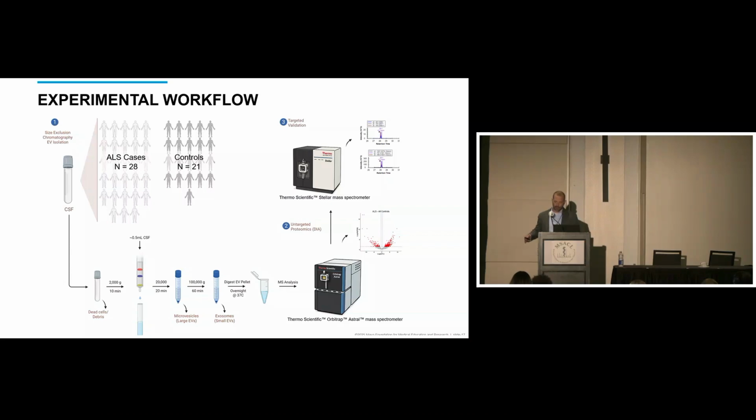So we took that forward, we digested it, and we worked with our friends at Thermo to analyze it on an Orbitrap Astral with DIA. And then we found some candidate markers, and we followed up with some targeted validation on the Stellar.